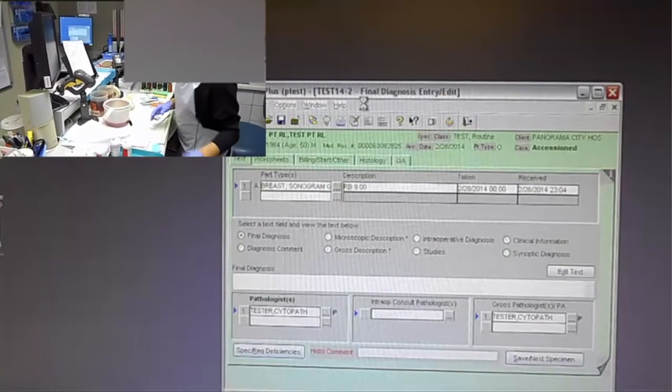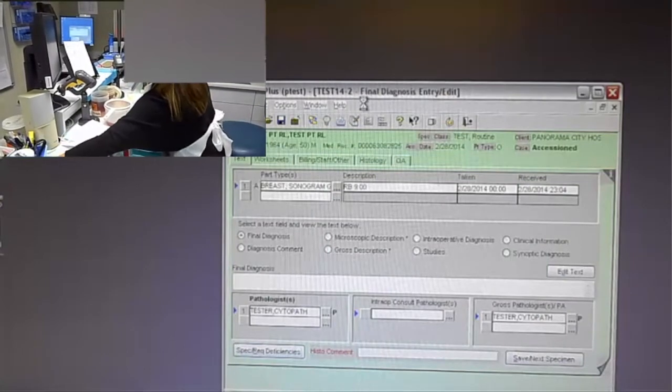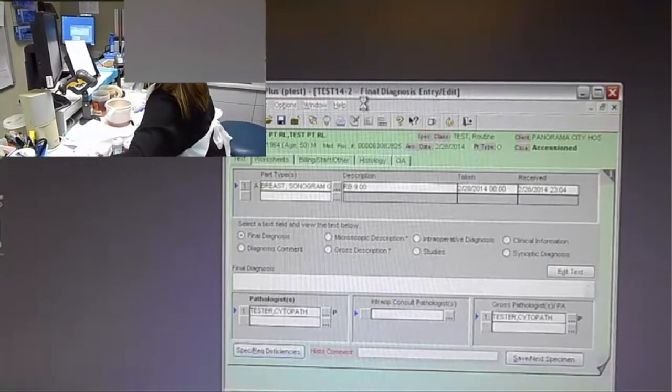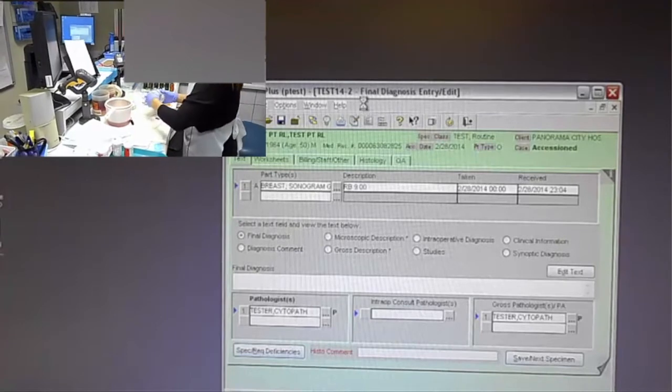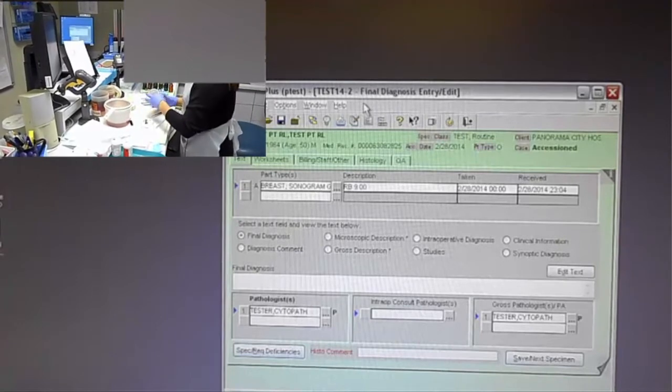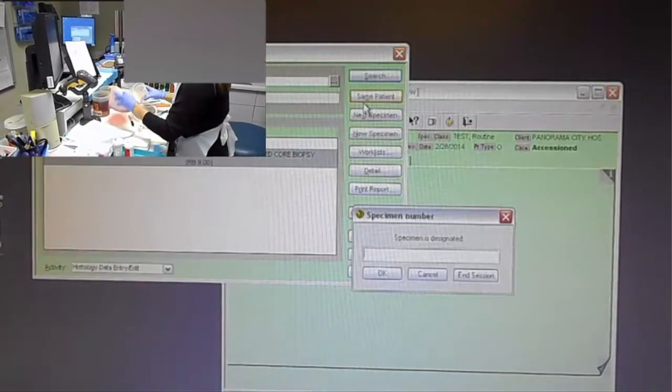Scans our cassette, next case, moves us back into final diagnosis entry edit, moves us back into histology data entry ready to be scanned for the next specimen.